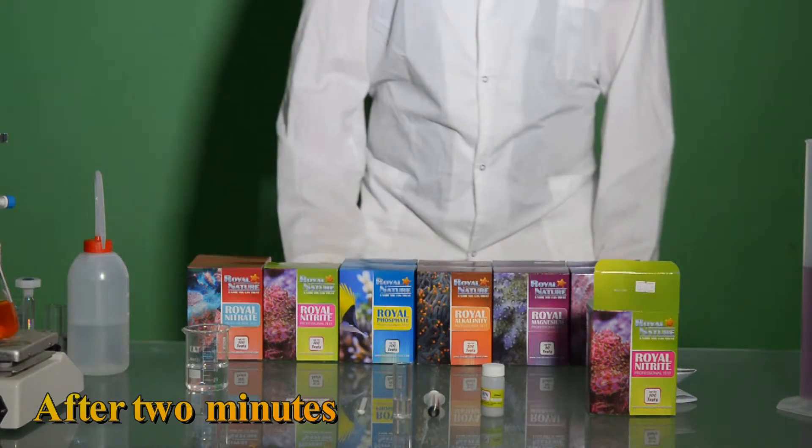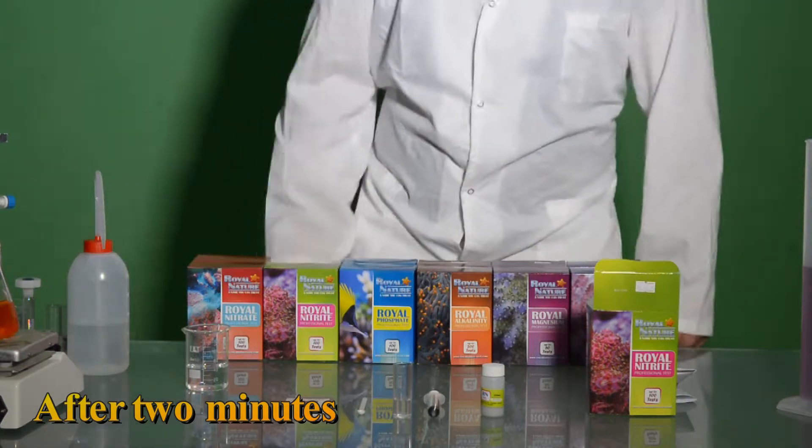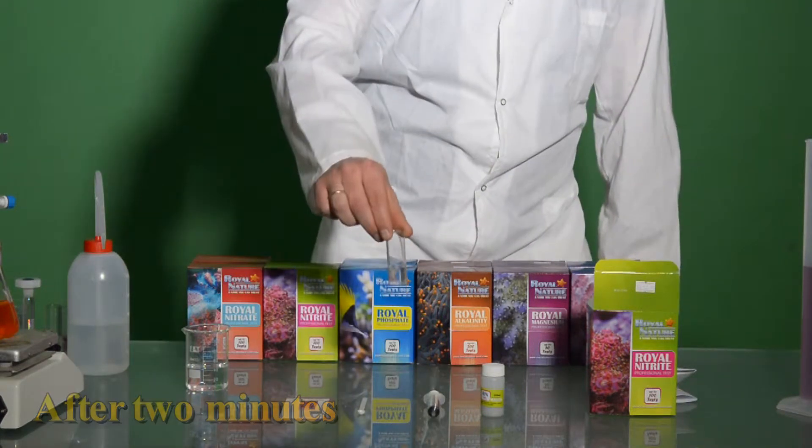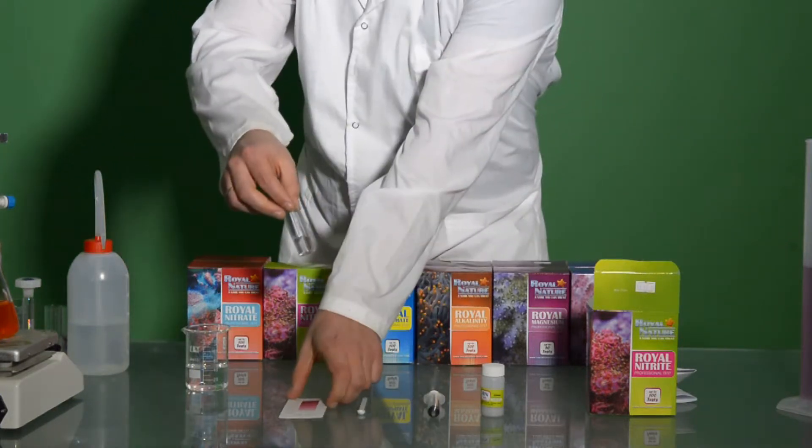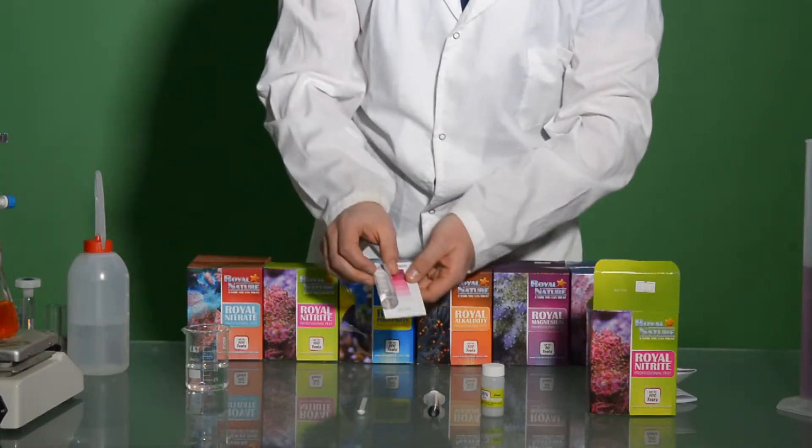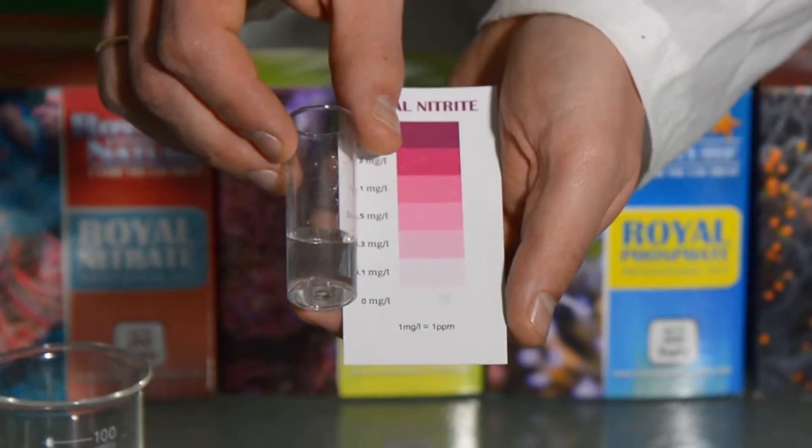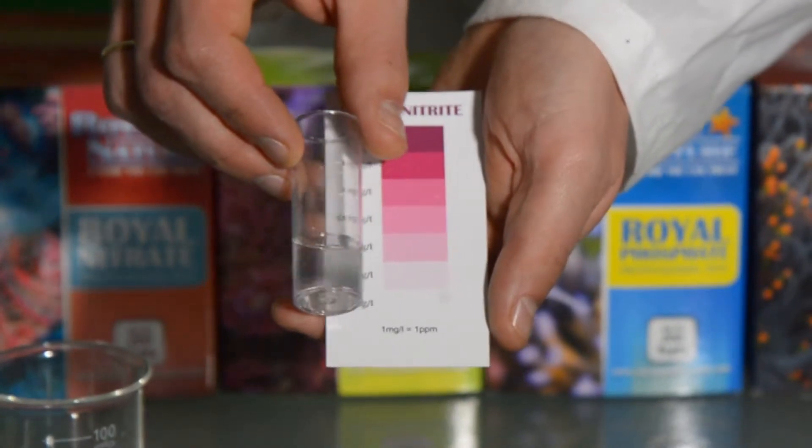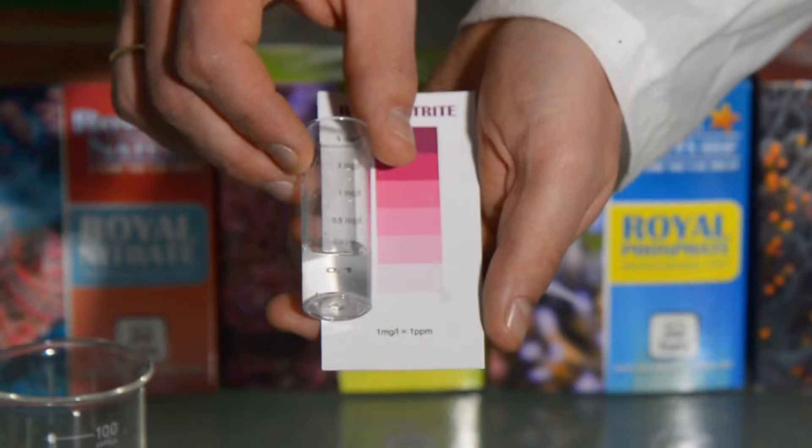hold the test vial next to the supplied color chart on a white part of the chart and compare the colors looking from the side of the test vial. Read the corresponding nitrite contents. An intermediate color corresponds to intermediate nitrite contents.